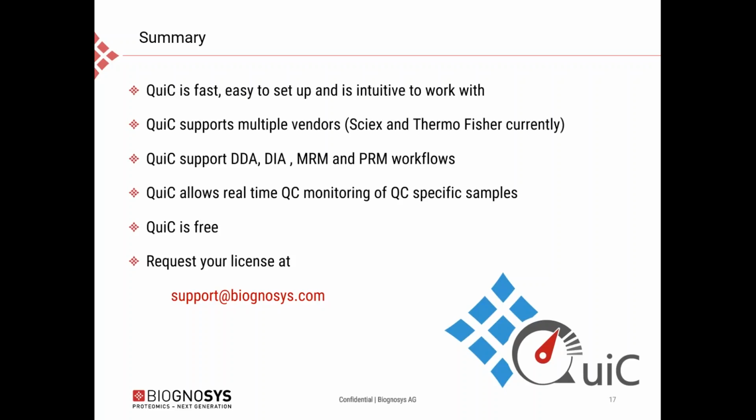The next question: are only the IRT peptides analyzed, and is the background library only for DIA and not for DDA? As we mentioned before, QuiC is doing QC analysis on two parts. The first part is the IRT peptides for all workflows that QuiC is able to analyze, and on top of that, QuiC is also doing a QC analysis on a pre-specified library for DIA and DDA. This library comes in the kit file and by default is set as a HeLa background.